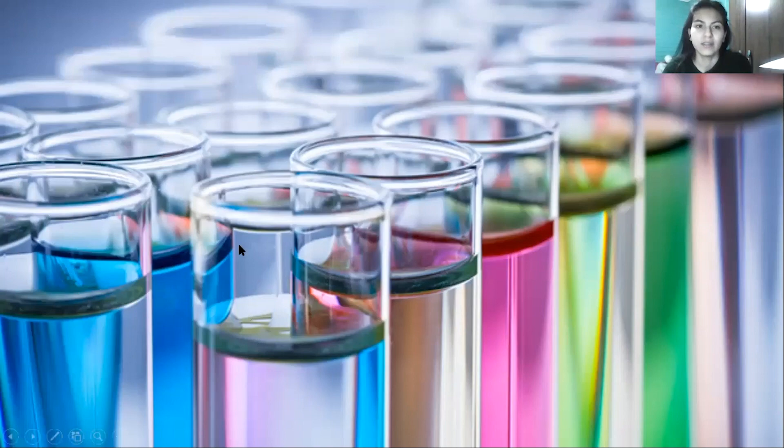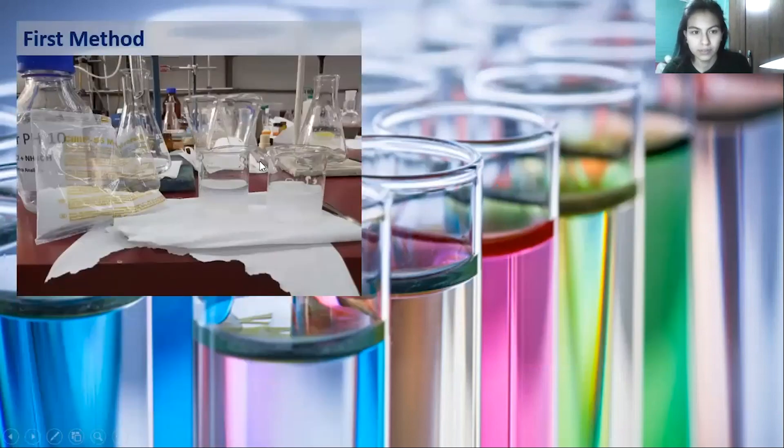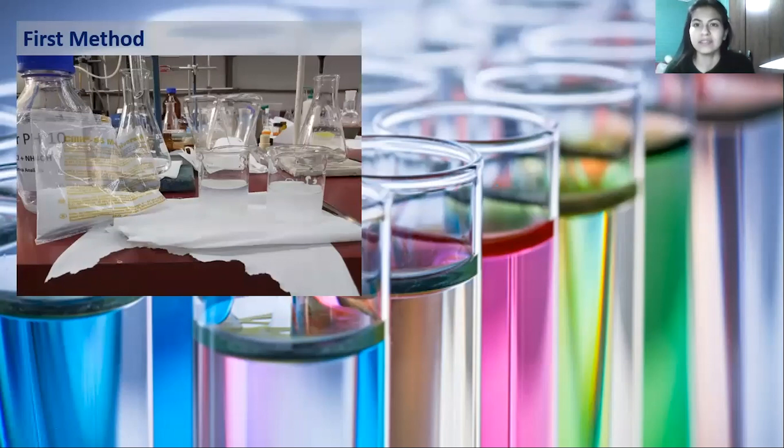At first, we use a product called Silly 55 MH Universal. This is a food grade product to soften the water.